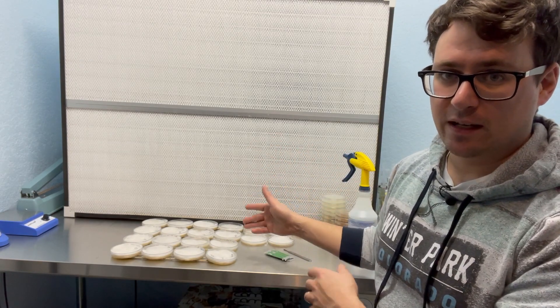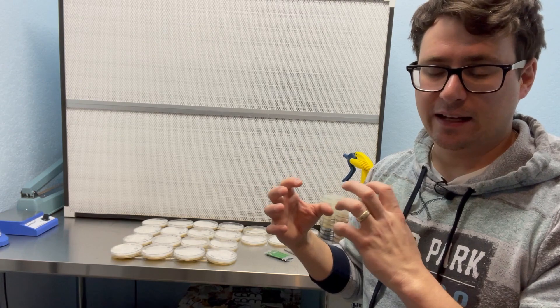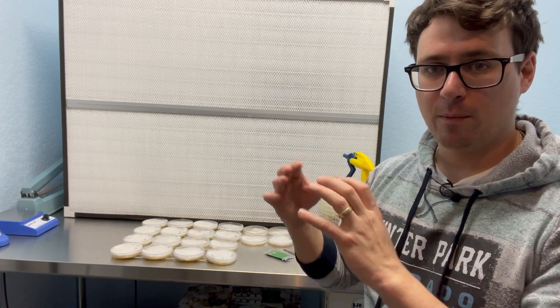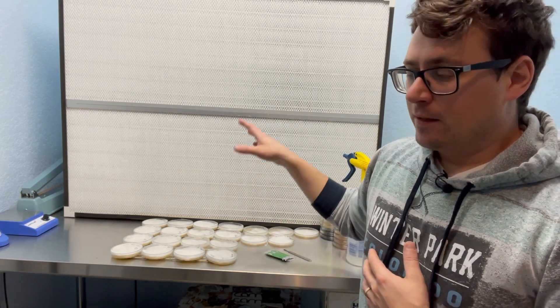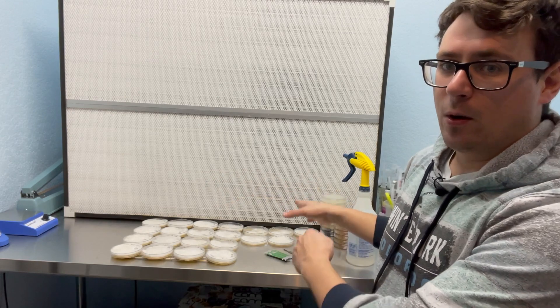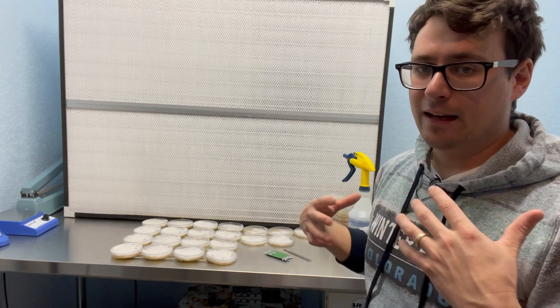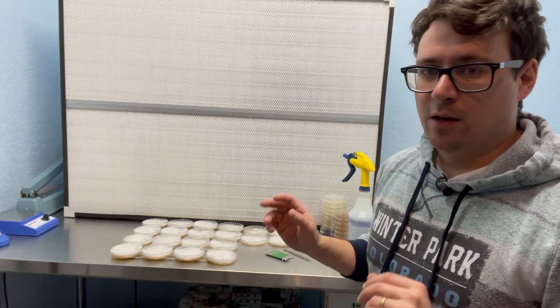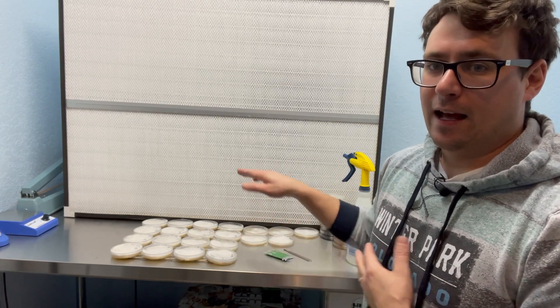And then there's a couple really good examples here of incompatible mating pairings. What happens is they come together and they don't have the right genetics, so what they do is they'll form a zone of inhibition and that's just a region where they kind of fight for resources but then eventually they'll just fizzle out. So I'm going to flip this camera around and then I'll point out the different pairings that I think are going to do really well and then some of the incompatible pairings with the zone of inhibition.